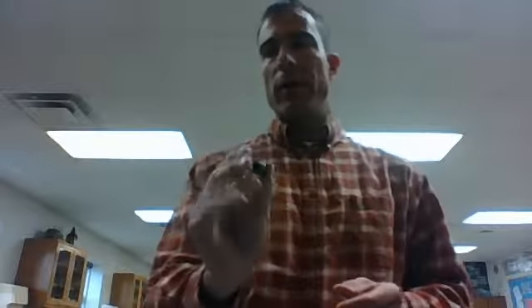The next thing I have is a stopper, a rubber stopper, and this is often used in test tubes. You just put it on the end. Now this stopper is a little bit small for this test tube, but that's what you could use it for, is closing up a test tube if you do not want any fumes or things to come out of that test tube. So this is a rubber stopper.